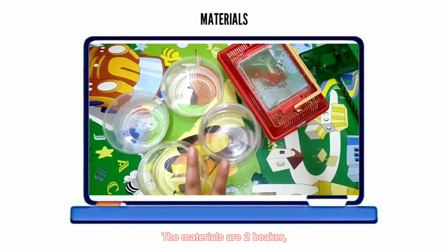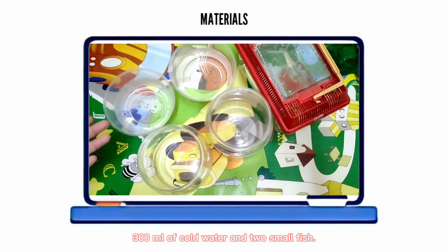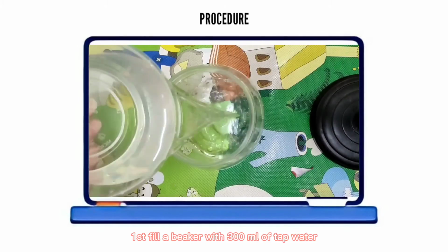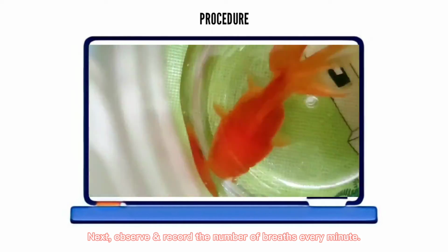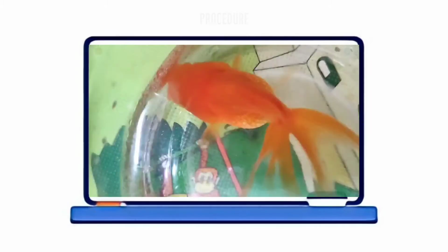The materials are 2 beakers, 300 ml of tap water, 300 ml of cold water, and 2 small fish. Let's fill a beaker with 300 ml of tap water and place a fish in the beaker. Next, observe and record the number of breaths every minute. Third, repeat steps 1 and 2 using 300 ml of water from the fridge.